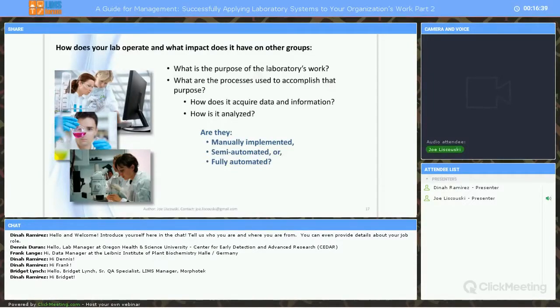Some stages may be easily automated and offload people, reducing the cost and increasing the throughput. Fully automated systems are least costly to run on a per sample basis, have a sizable upfront cost for implementation, and are the least adaptable. So what are the trade-offs in your work? It may vary from one experimental setup to another.